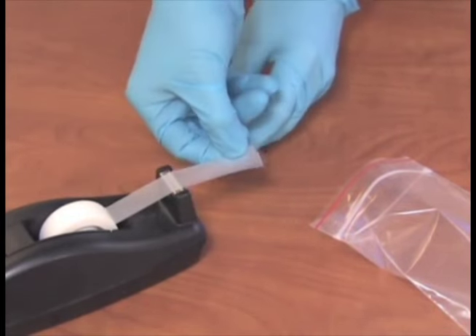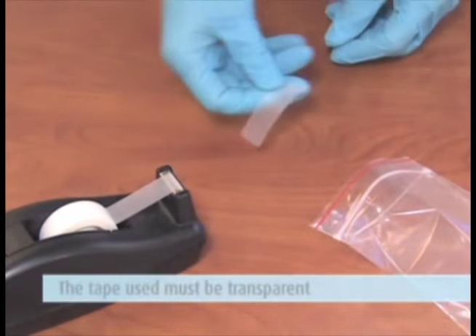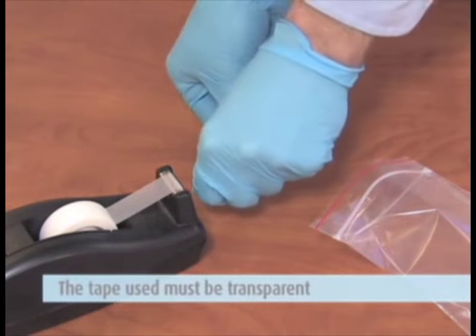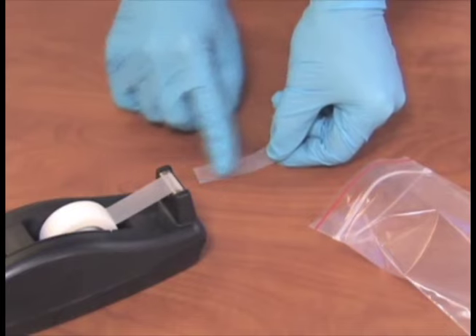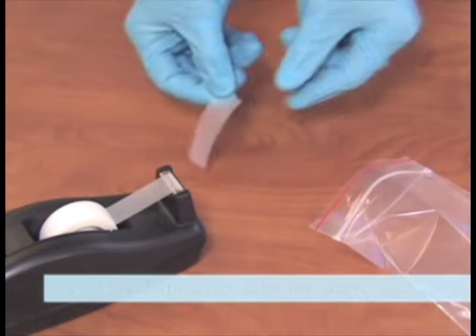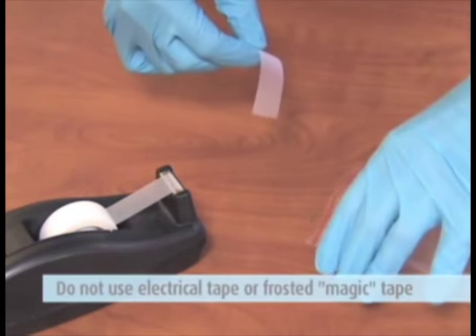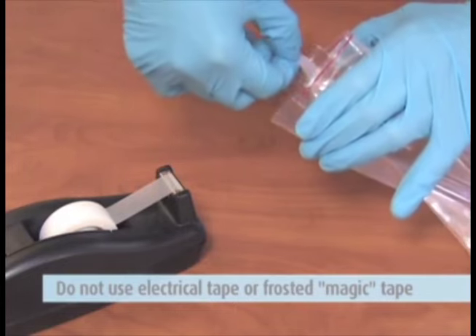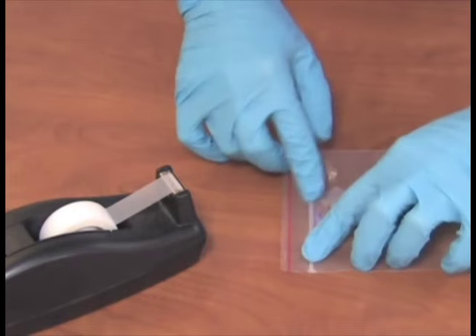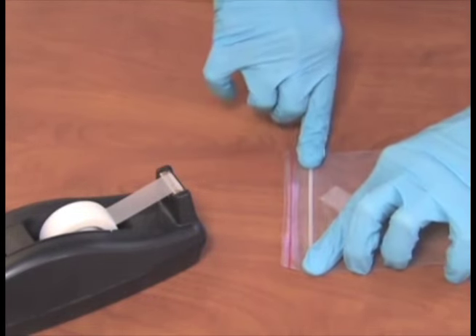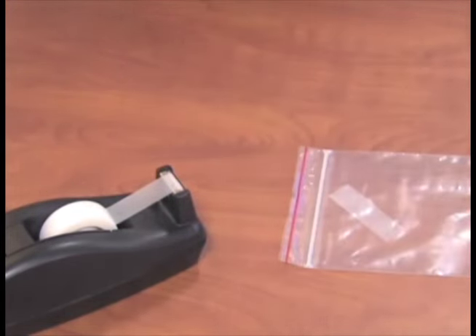Notes for tape sampling. The tape used must be transparent, as the sample will be analyzed by direct microscopy, and therefore must be able to transmit light. Do not use electrical tape or frosted, magic tape, as no analysis can be completed. Avoid creasing or folding the tape. The tape should be as flat as possible at all times to ensure accurate analysis. Creases interfere with the ability to visualize the trapped spores on the tape.